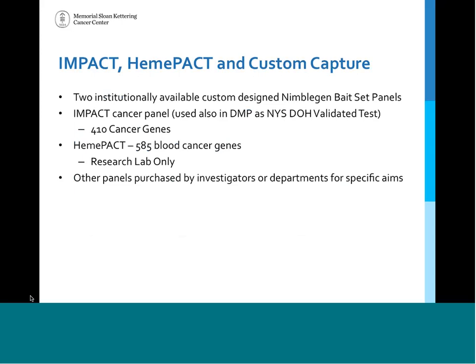And the reason we did this is because a number of our processes are very similar. So we have two institutionally available custom designed capture panels and bait sets. The first is IMPACT, and this panel is designed in such a fashion that it covers 410 known cancer genes that are commonly mutated in solid tumors. And this panel is also used in the diagnostic molecular pathology lab as their clinically validated test.